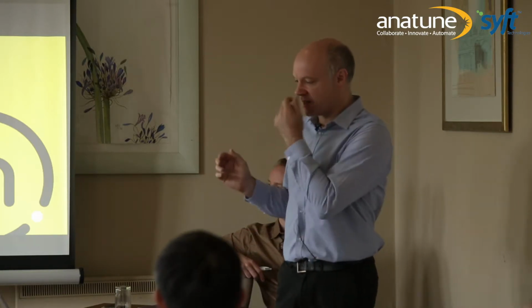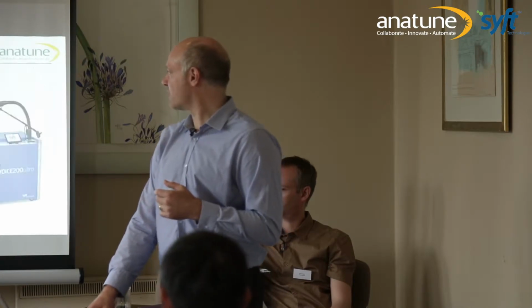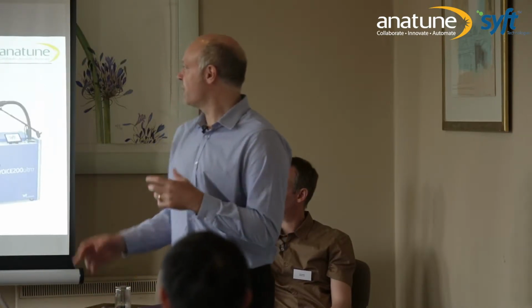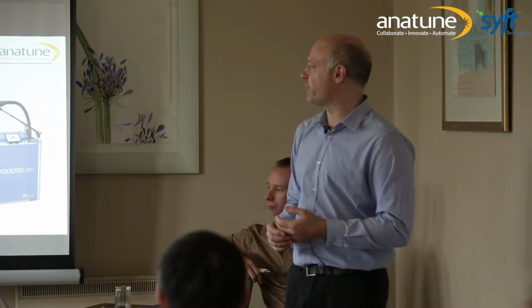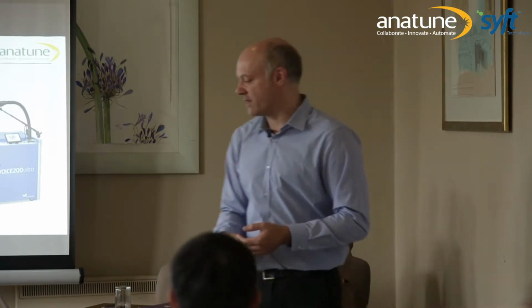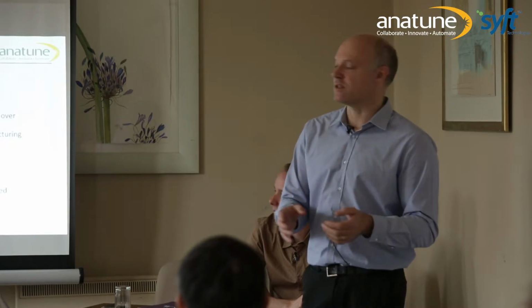So this part of the presentation was put together by Joe, and I'm pretty much presenting it as he presented it, so bear with me. We can move through the first bits. I didn't want to take them out as it is his presentation, but this is stuff we know about SIFT-MS, the analytes we can use, how it can look for some particularly difficult compounds. For example, formaldehyde in this case for this validation, and also applications: residual solvents in drugs, packaging selection, compatibility, contamination in products, which is what this validation was about.